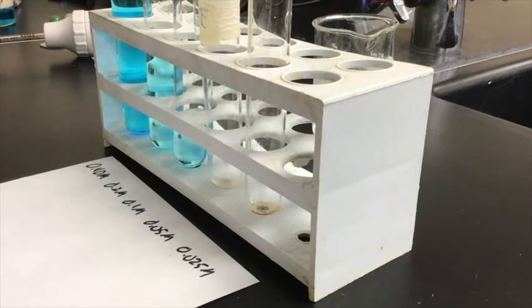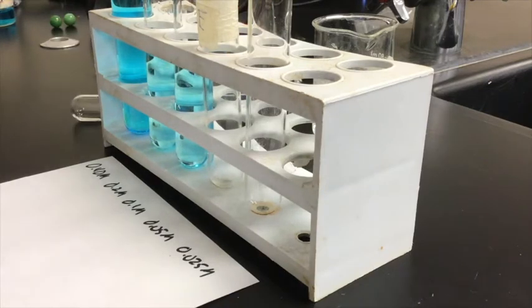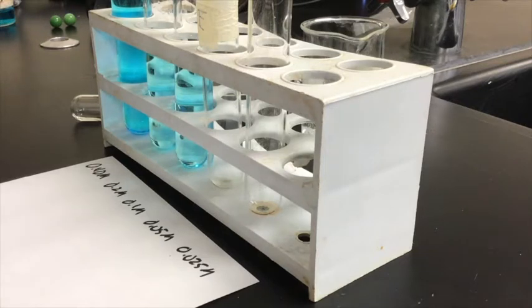And by taking 10 milliliters of the 0.2 molarity and putting it into the next one, okay, and now I have that. And now what I'm going to do is take this guy here and get 10 milliliters of water. And if I put 10 milliliters of water into this solution, like so, this guy now is going to be a 0.1 molar solution because I have cut it in half again.